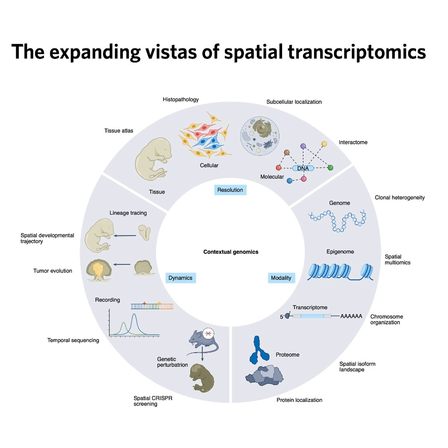We've talked about spot sizes and crowding. How do we get from mapping general tissue regions or cell neighborhoods right down to precise subcellular localization? That's a major frontier. Currently, as we discussed, most SST methods that don't have single-cell resolution require computational methods, deconvolution, to estimate which cell type contributed which RNA molecules to a mixed pixel. That gets easier as pixel size approaches cell size, of course. And for IST? For IST, the challenge is often computational, too: accurately segmenting the image to assign individually detected transcripts back to their parent cells.